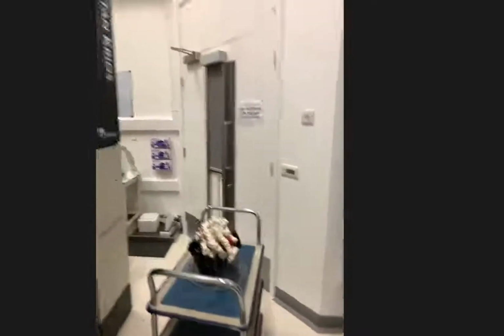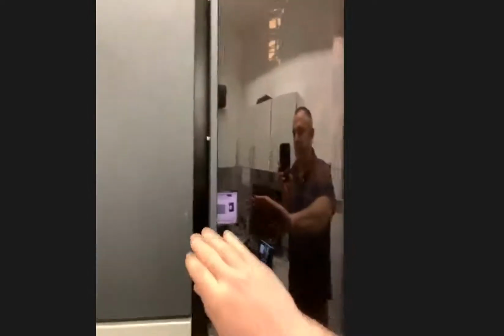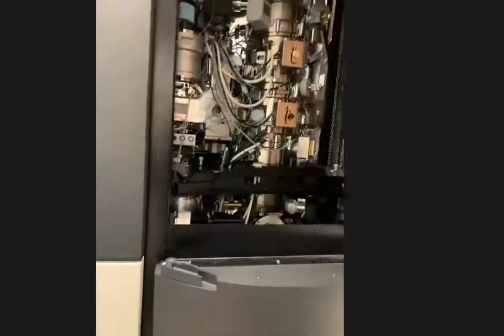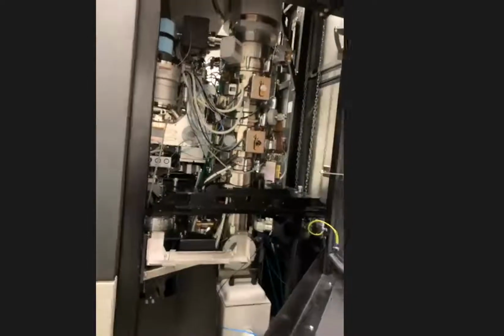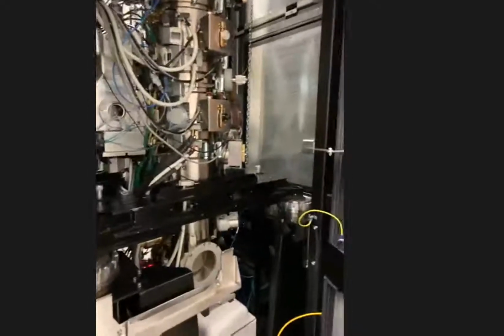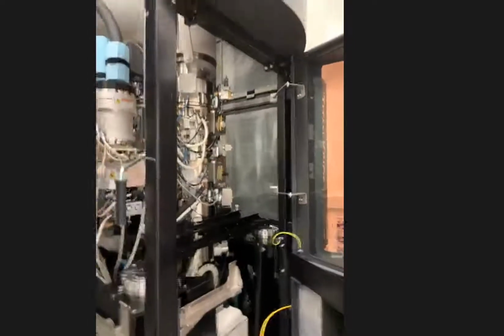Yes, that's good. Right. So there's the model. This is the electron microscope. So if I press this button, it opens up. And you can see it's a huge machine. I mean, you saw that before. It's a huge machine. And also the facility manager very kindly opened this side as well, so we can really take a good look.